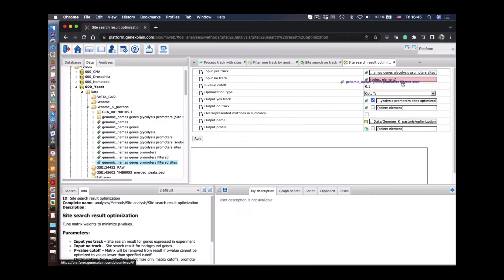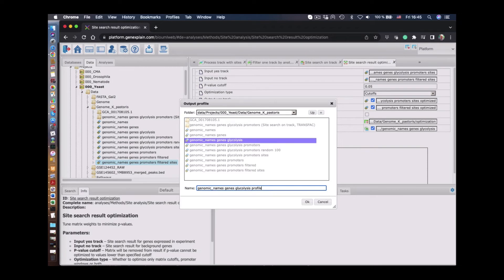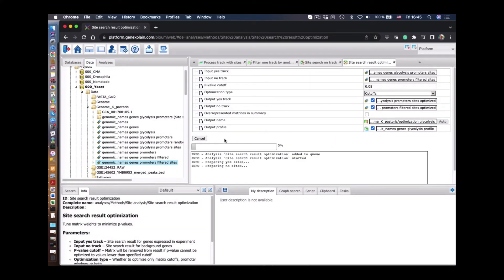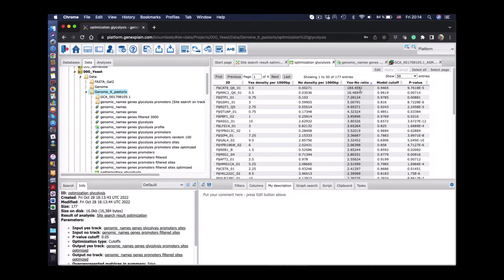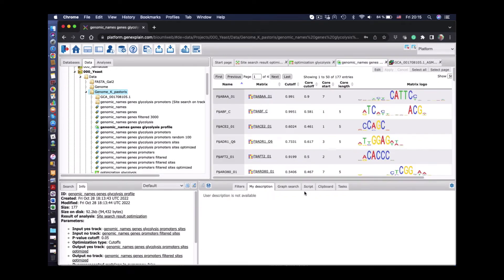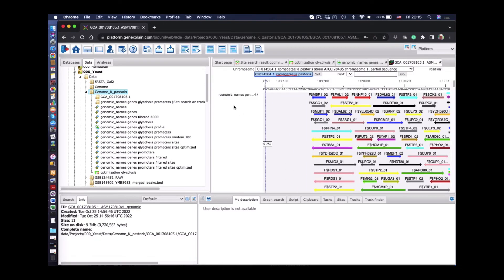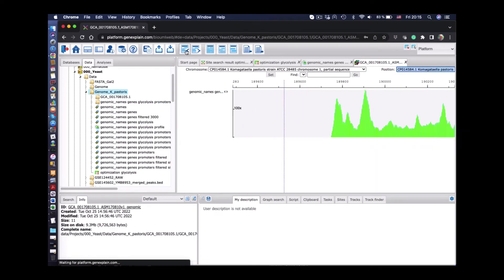We start a function called 'Site Search Result Optimization' and input the site sets from the promoters of glycolysis genes and the promoters of other genes. We define the cutoff by p-value and specify parameters of the search and the output files. We get the results: 177 positional weight matrices are enriched in the promoters of glycolysis genes. Here we see the profile of these 177 matrices and how their sites are found in the promoters of those genes.